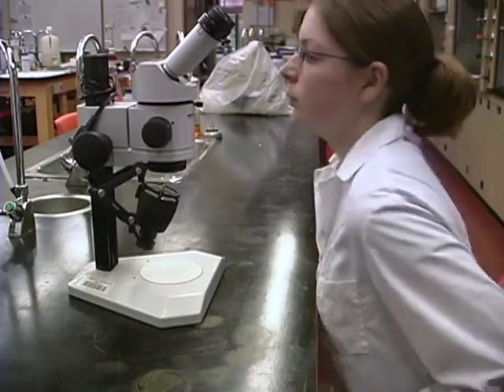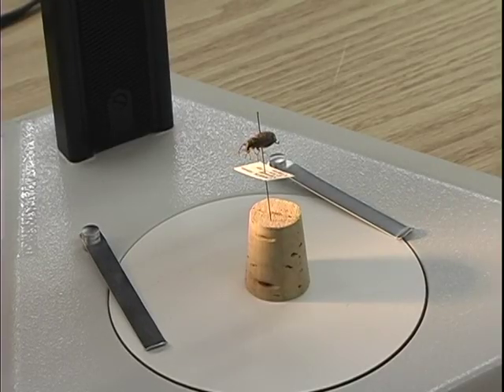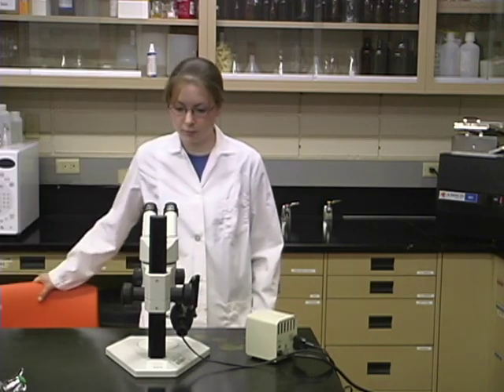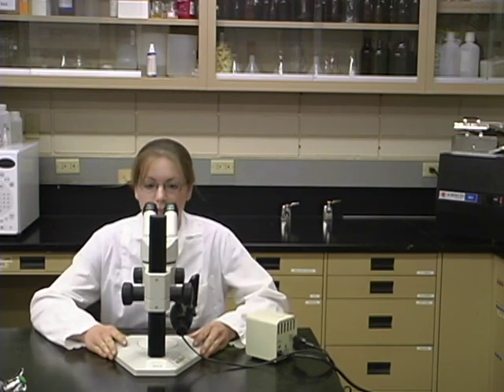A solid support will also reduce vibration, and vibration reduces image clarity. If you are going to use a microscope for a long period of time, use a chair that allows you to comfortably look into the ocular lenses and easily adjust the microscope and object.